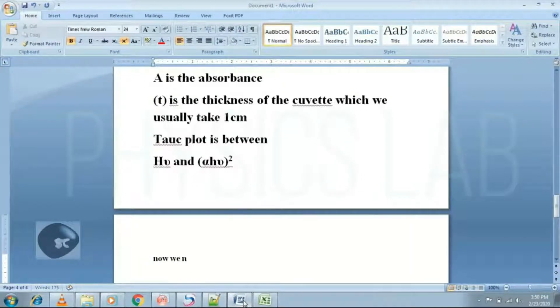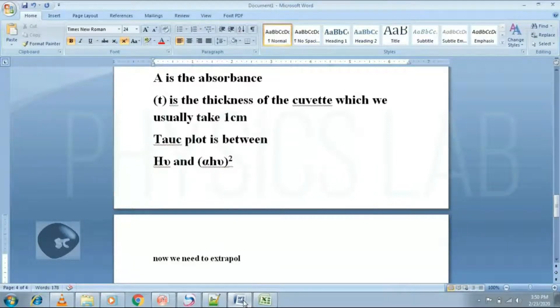Now this is the most important step: extrapolate from the band edge. The point where it touches the x-axis gives the band gap.